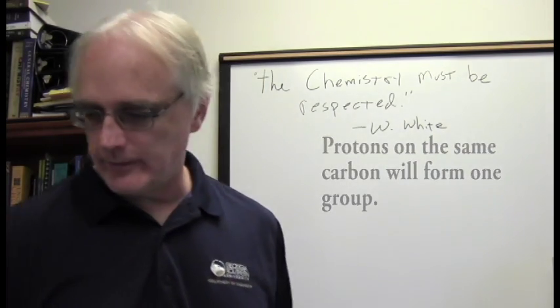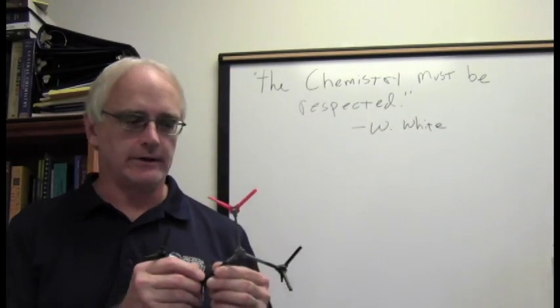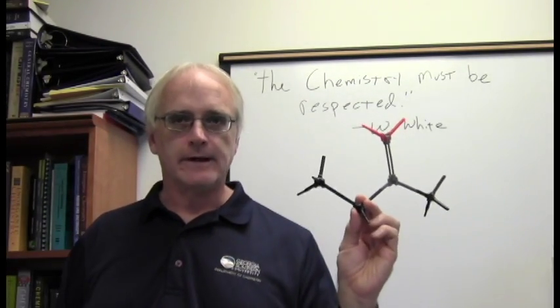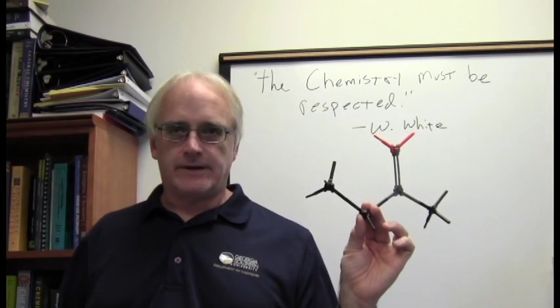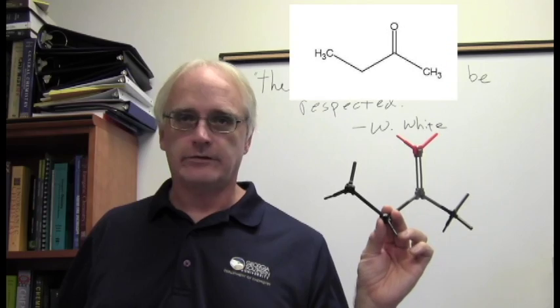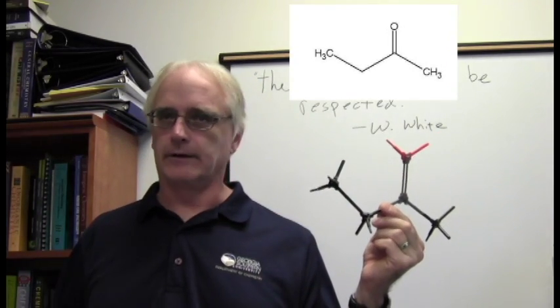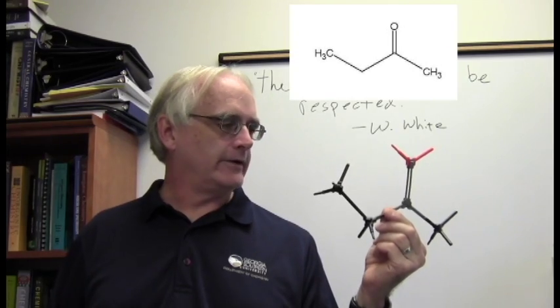So now, consider this molecule. It's the one we use as our standard in our instrument, methyl ethyl ketone. If I hold it up over here, it looks fairly distinct. Sometimes it's a good idea to be able to look at these things in the classic organic chemistry structure. Sometimes you just really want to be able to look at the classic molecular model. So that's what we have here.